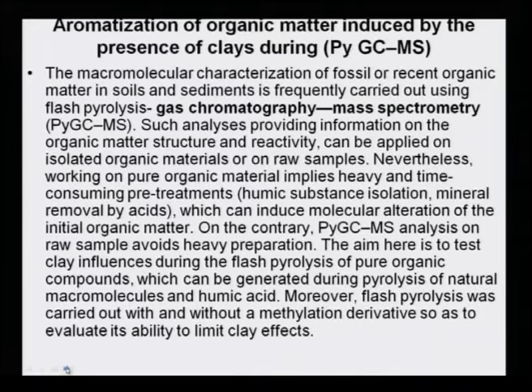The aim here is to test the clay influences during the flash pyrolysis of pure organic compounds, which can be generated during pyrolysis of natural macromolecules and humic acid. Moreover, flash pyrolysis was carried out with and without a methylation derivative, so as to evaluate its ability to limit clay effects.